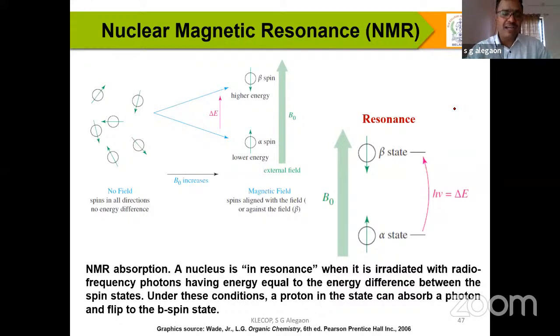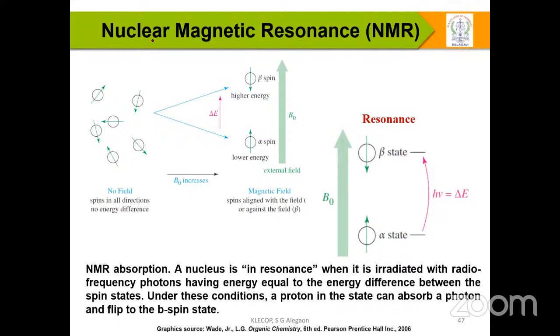A proton acts as a tiny magnet, just like any magnet does. So all protons act as tiny magnets, having both charge and momentum, and so they form a magnetic character.